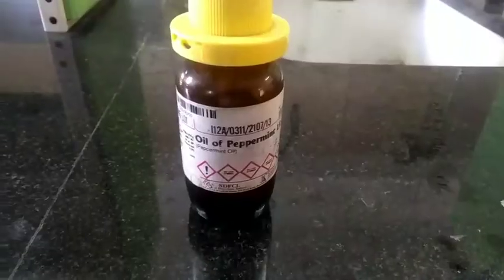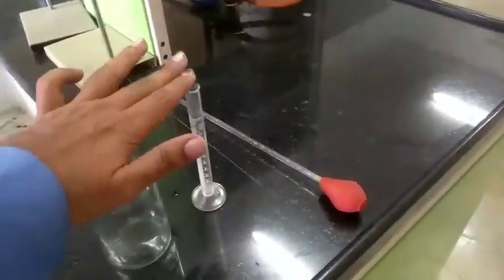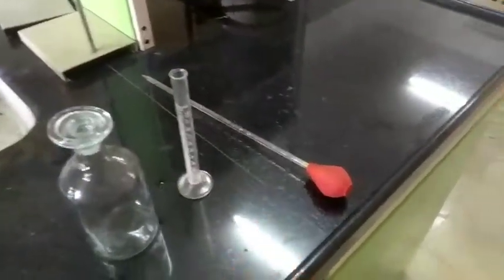Peppermint oil, reagent bottle, measuring cylinder, and pipette, which is a 1 ml pipette.